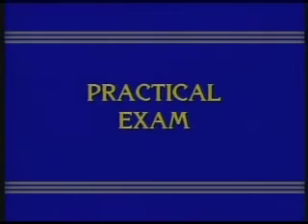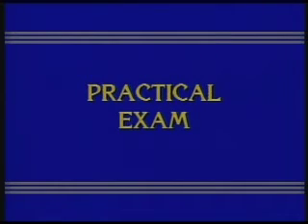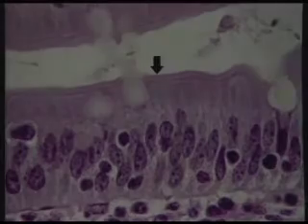Now we're going to start a practical exam, and I'll tell you what the format's going to be. It'll be quite simple. I'm going to point to a particular structure on the screen with an arrow and ask you what it is, and then I'll give you 10 seconds to think about what it is. Now 10 seconds isn't an awful long time. If you need more time, just stop the tape. And then at the end of 10 seconds I'll tell you what it is, and if you assume pencil and paper and write these things down as we go, you'll have a notion of how much you've digested. So here we go. Question number 1.